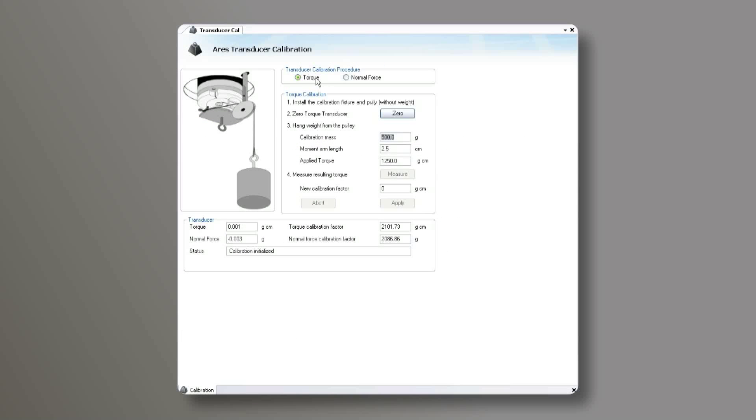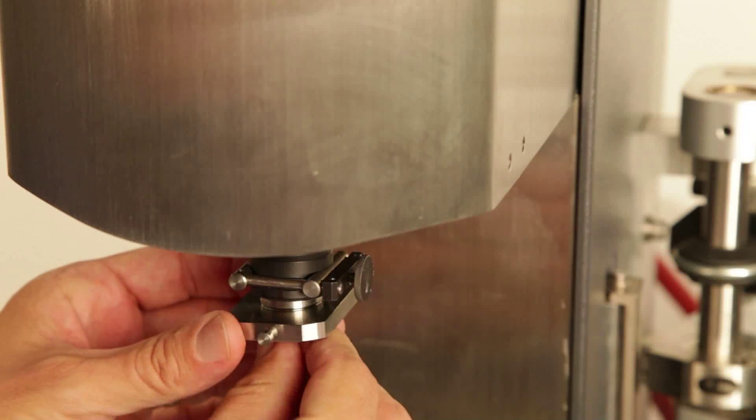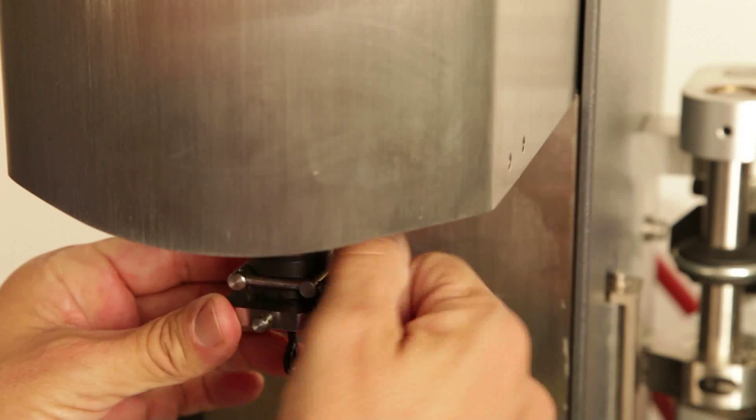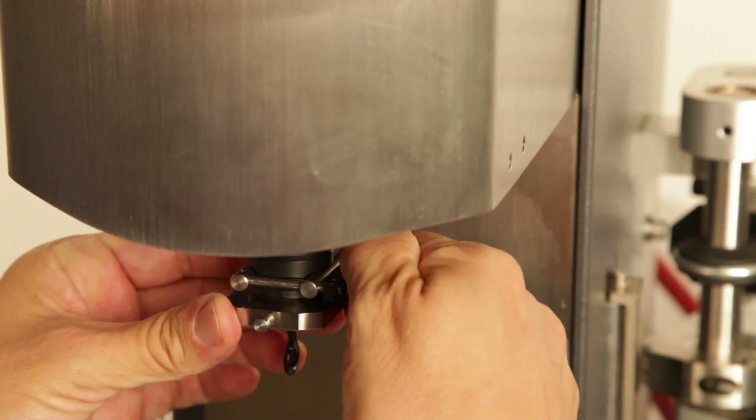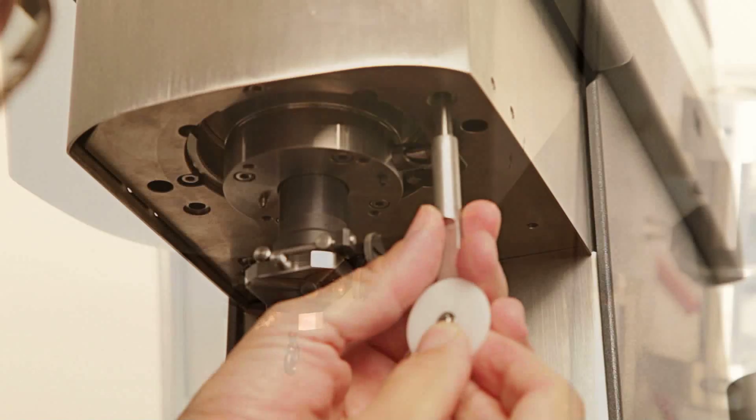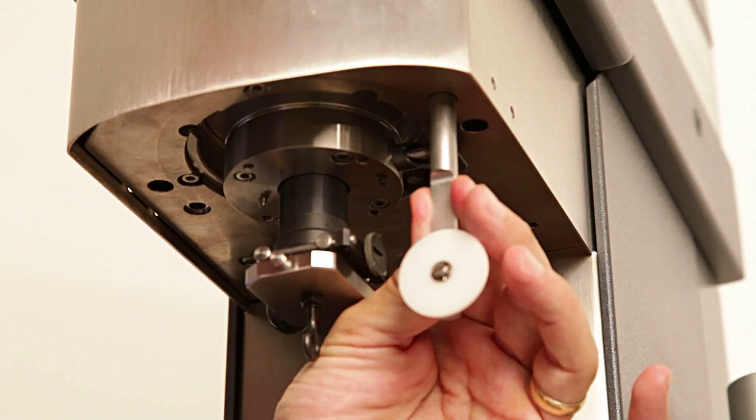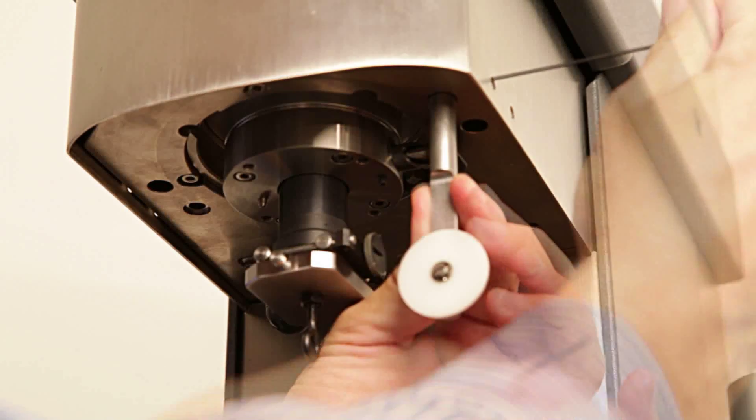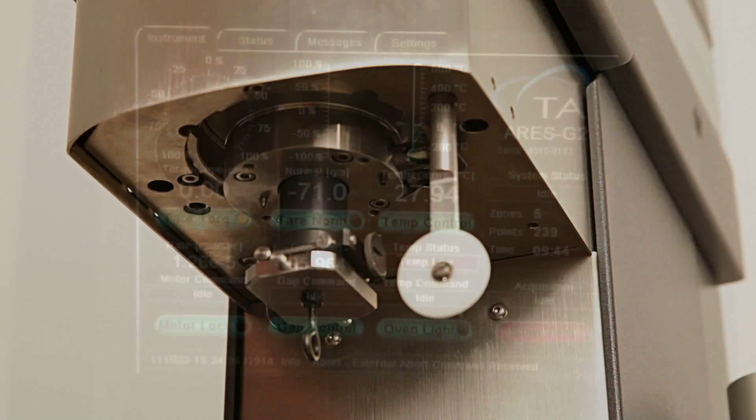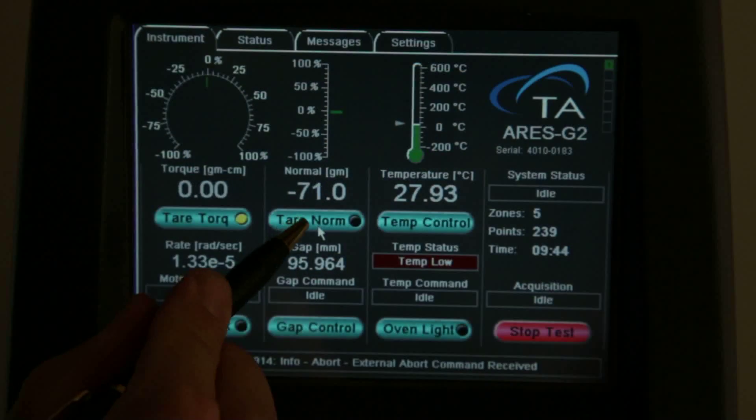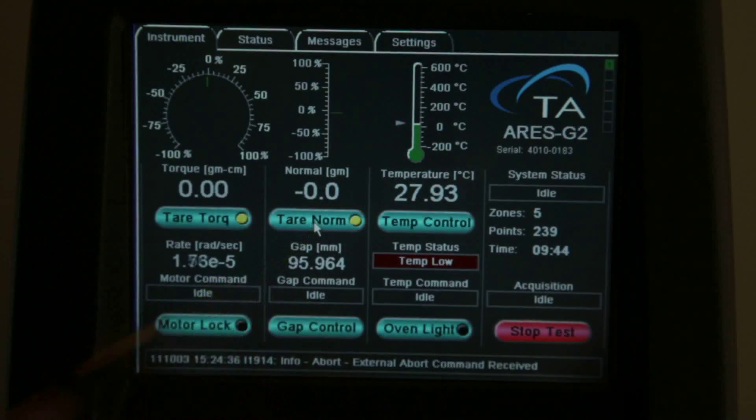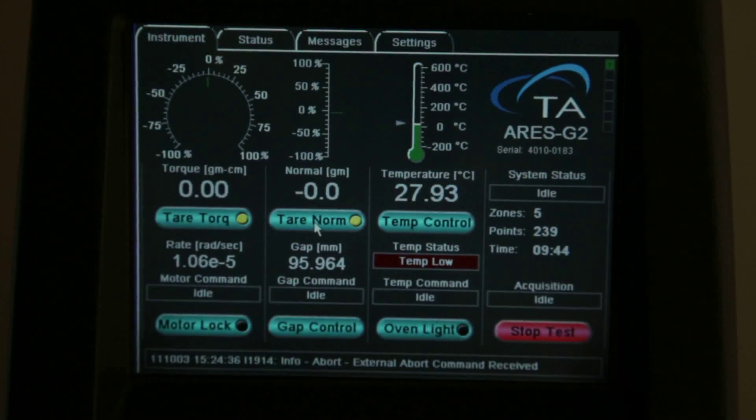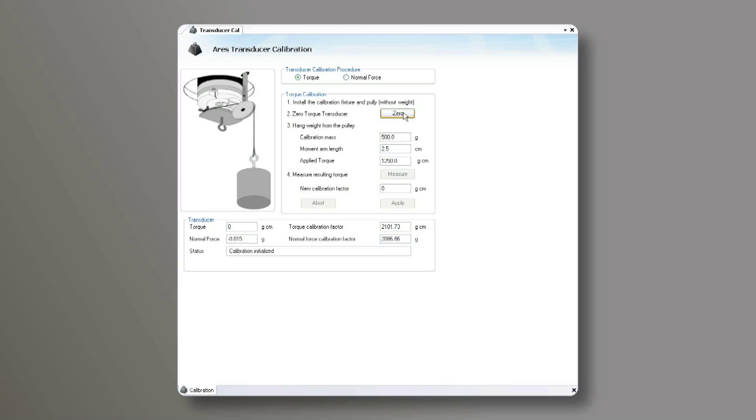Next, choose Torque Calibration. Install the calibration fixture on the transducer shaft, then install the pulley in the correct position, tighten it with the set screw, and then zero the axial force signal using the LCD touch screen. Now, zero the torque transducer.